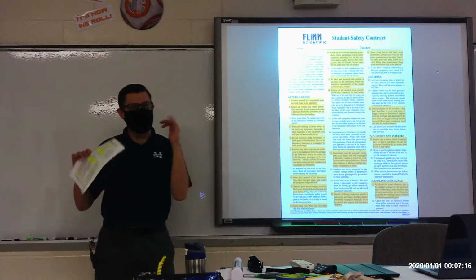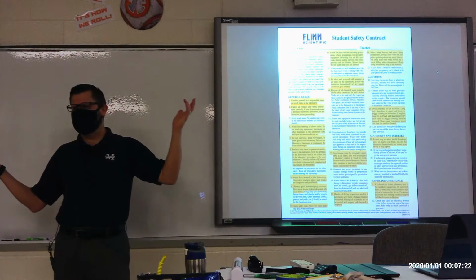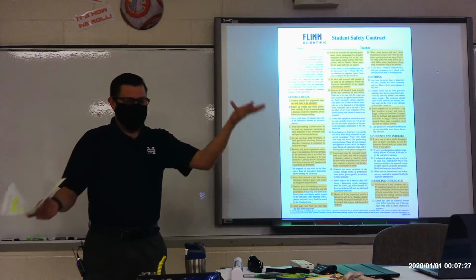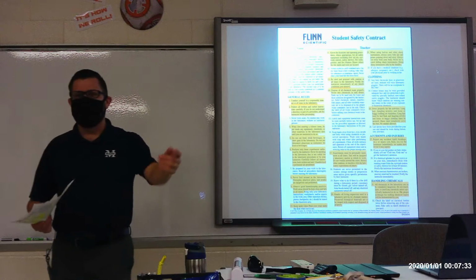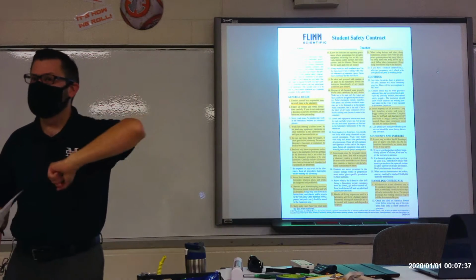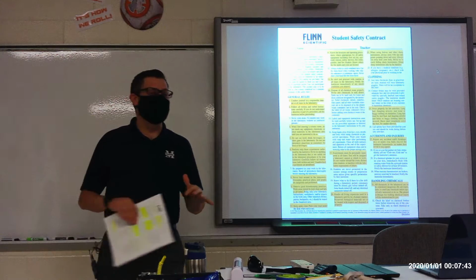Even if it's something that you think you know how to operate, like next week we're going to be using microscopes. If you walk in and it's like, oh yeah, I know how to use a microscope, and you start fiddling with the microscope, I've had plenty of times where students go, yeah, I already know how to use the microscope. Mr. Wassman, it's not working, and I walk over and flip the switch to turn on the light. Yeah, you really do know how to use that microscope. So just kind of wait for instructions before you get started.